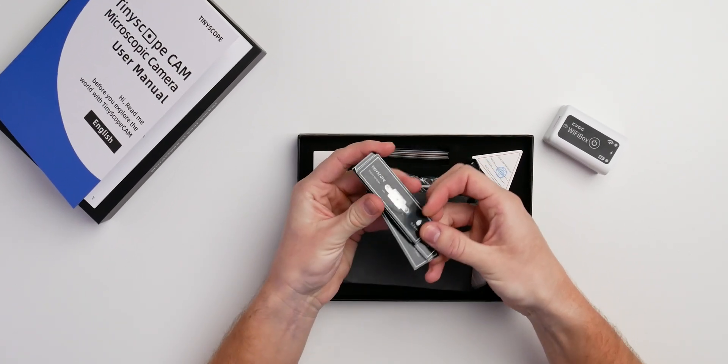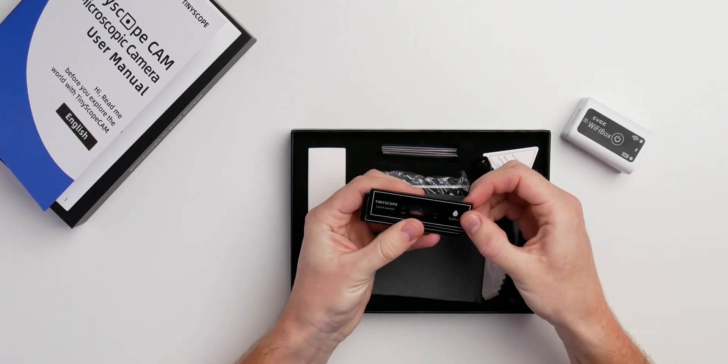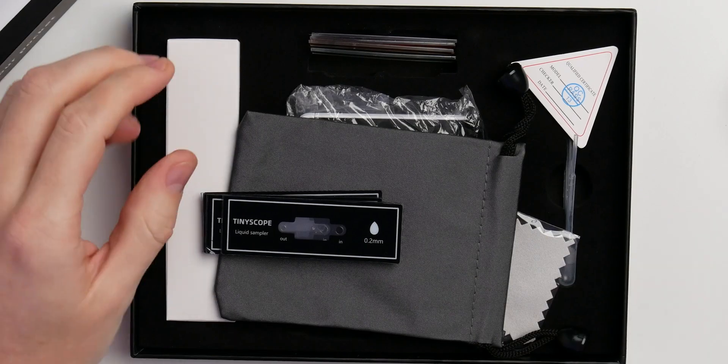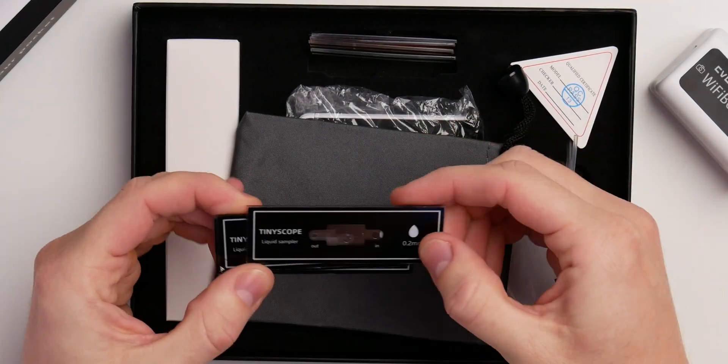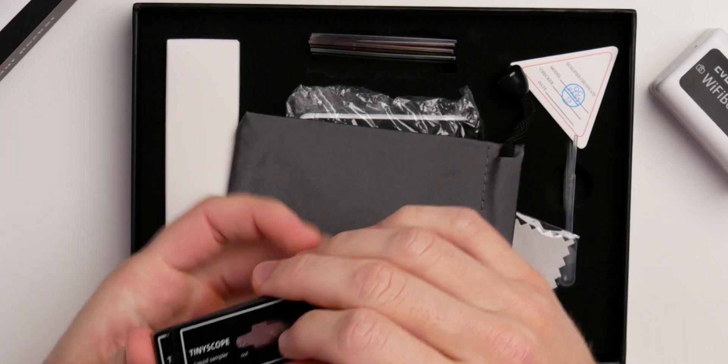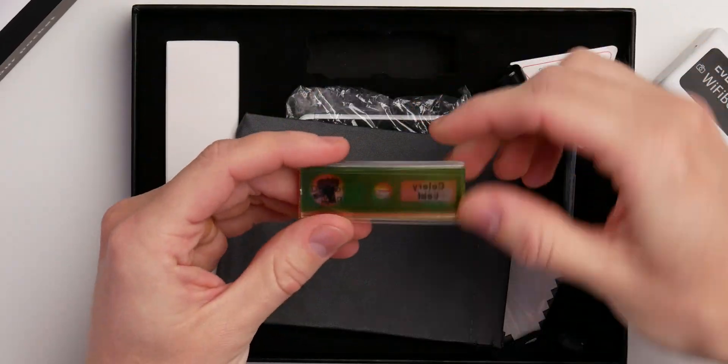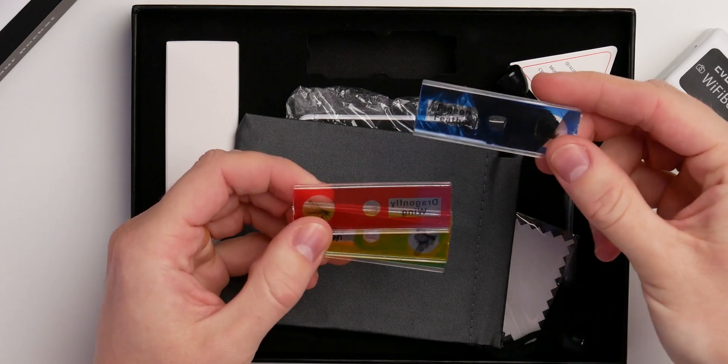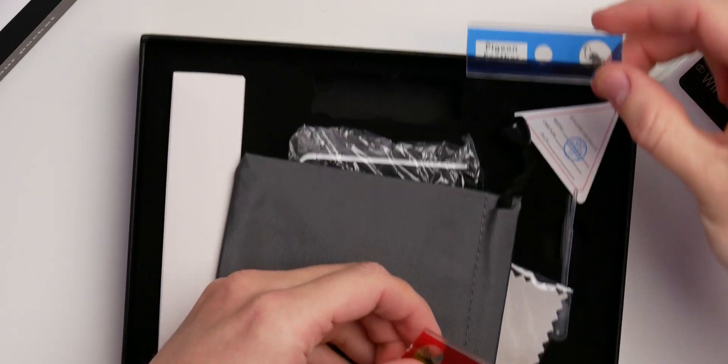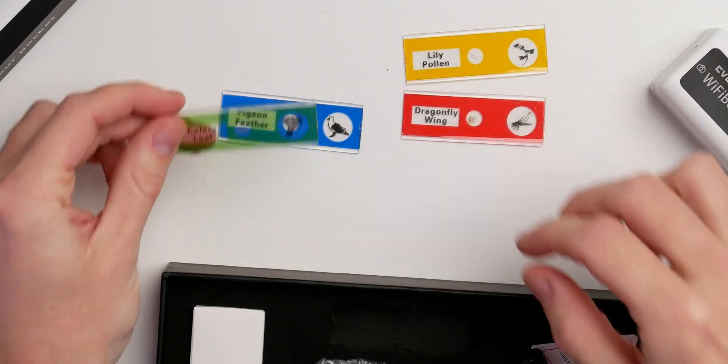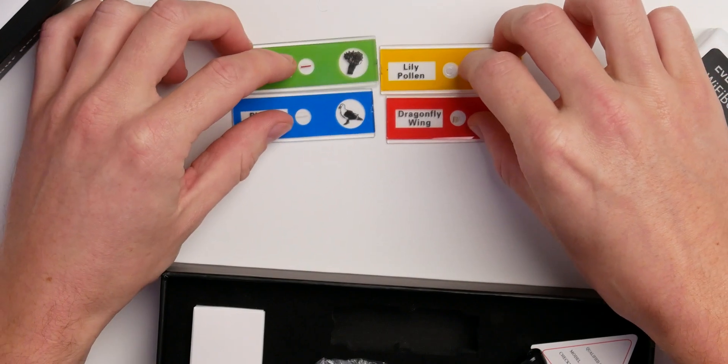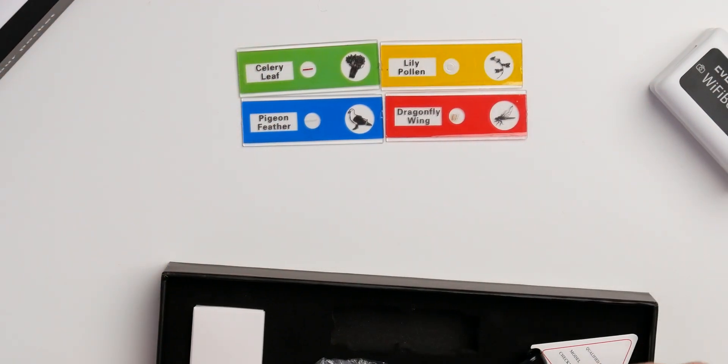So what do we got? We got the samplers here you can just use to insert your liquids. We just get all the liquid samplers here, super easy, super simple inside and outside. We get some probes which is also cool. So pigeon feather, dragonfly wing, lily pollen and serially leaf. So these are just some things you can just look at directly.